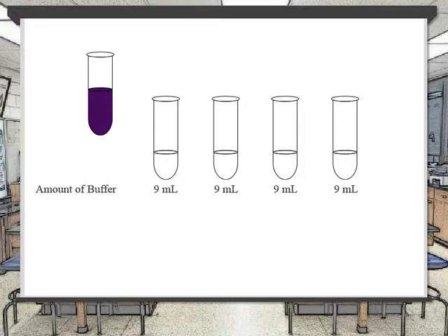Now let's put it all together in an example that includes the dilution factors. Suppose we would then take a sample from the original tube, in this case 1 milliliter, and we would add it to the first test tube.